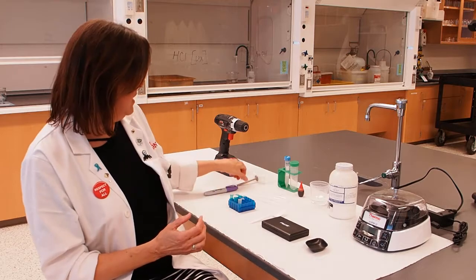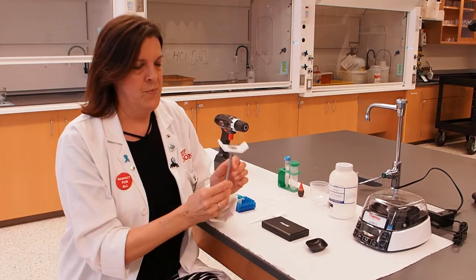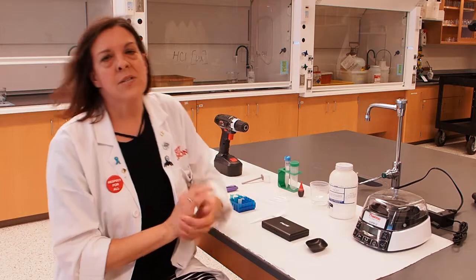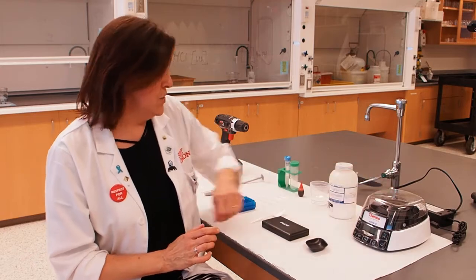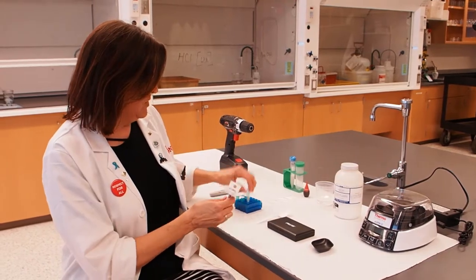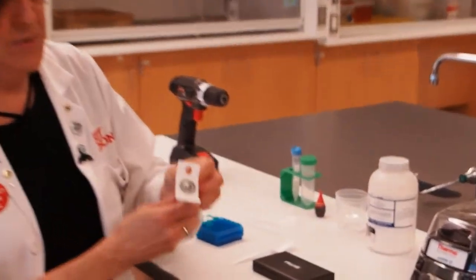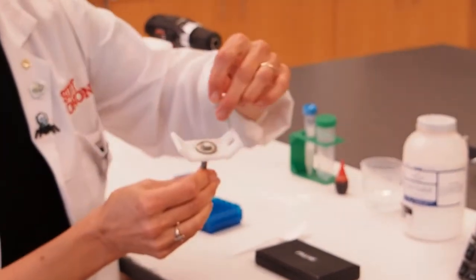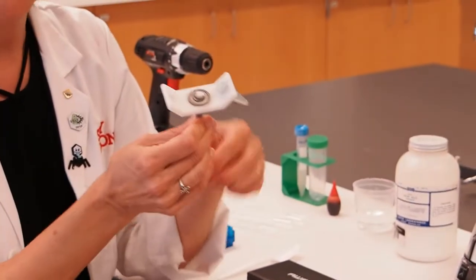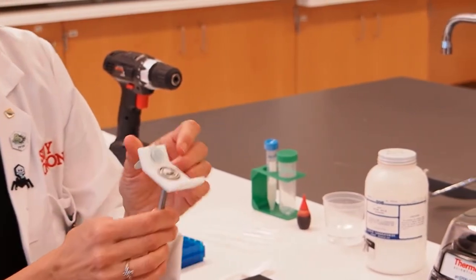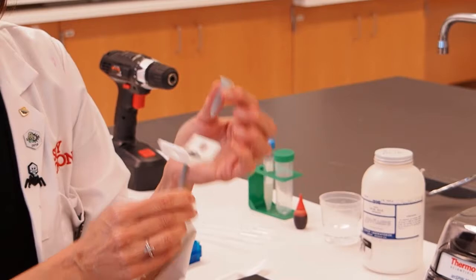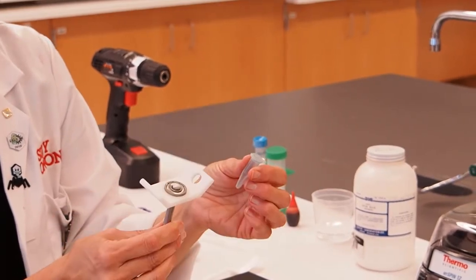We're going to be assembling a centrifuge out of a drill and this little adapter right here. To explain how centrifugation works, you would put your sample into the thing that's going to hold it. What the centrifuge does is it spins that sample around. So the sample is subjected to what we call centrifugal force.